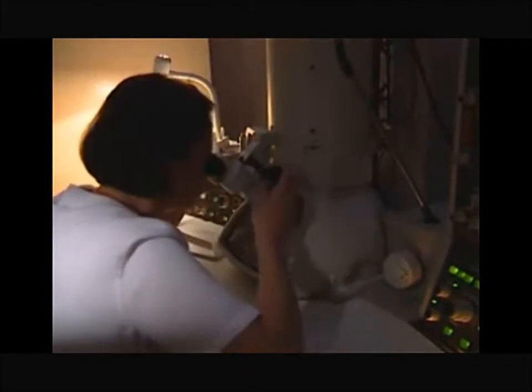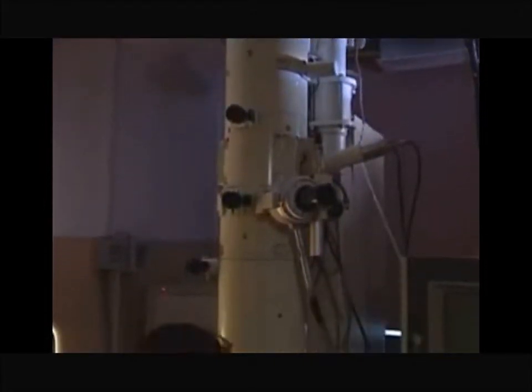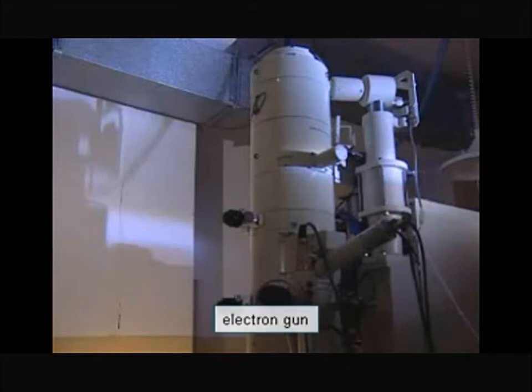The electrons are emitted by the cathode at the top of the tube and then accelerated by the anode. They then pass through a small aperture, which forms them into a beam, and into the vacuum inside the tube. The part of the microscope that generates the electron beam is sometimes called the electron gun.